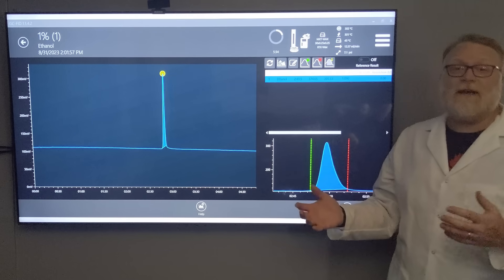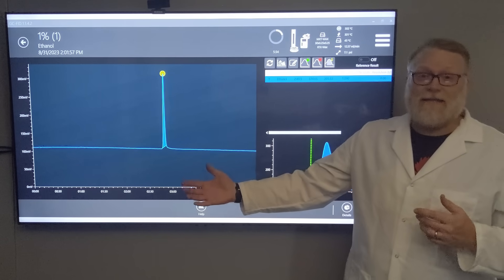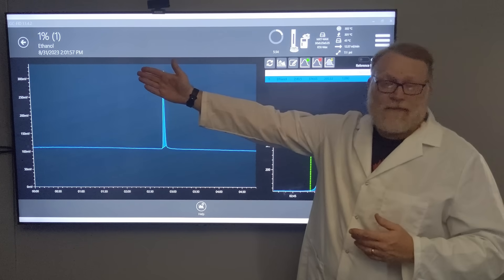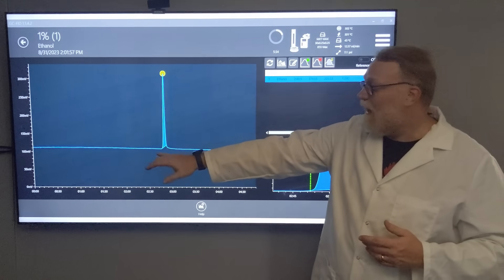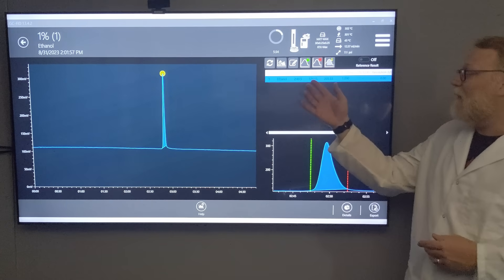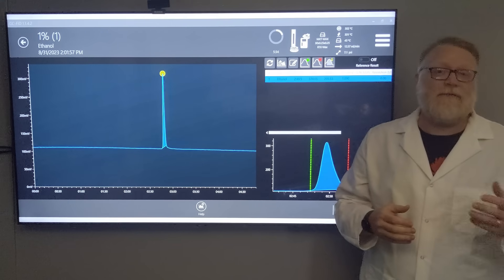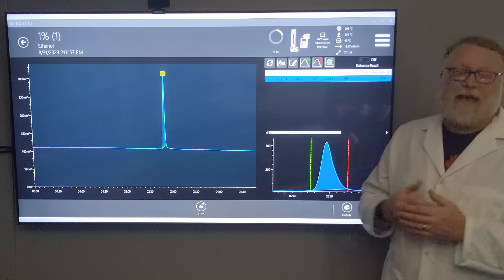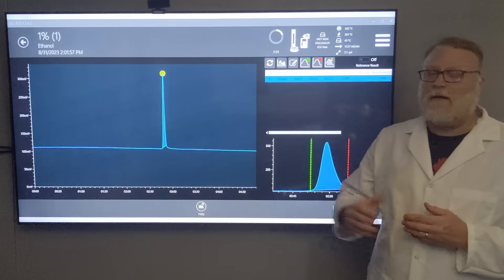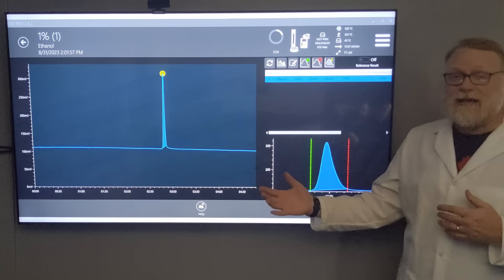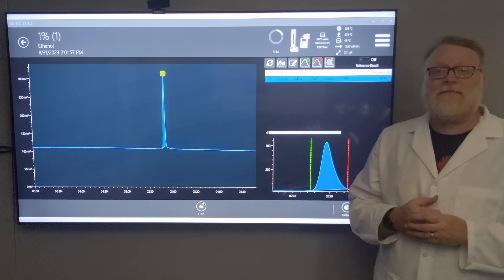This is known as a standard. How do I know it's a standard? Because I made it - I put 1% ethanol into my system and it gives me a peak. It comes out right here and gives me a specific area of 374.65 area counts. Every time I run 1% ethanol, I should get close to that area. That standard tells me that's what I put in there: 1%.